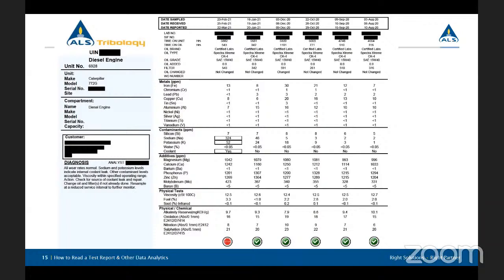Now, one thing not present here is water. And for those that have maybe looked at a lot of oil analysis reports or are familiar, you probably understand why. But perhaps there's some people here that are scratching their heads, because we know that most coolant is 50% water and 50% glycol. So if you're getting coolant ingested into an engine, how come there's no water? We've tested for it. We've shown that there's really no detectable water.